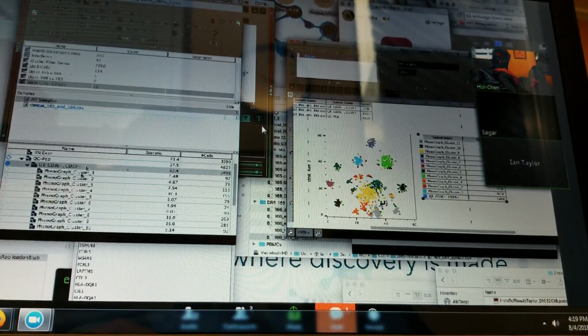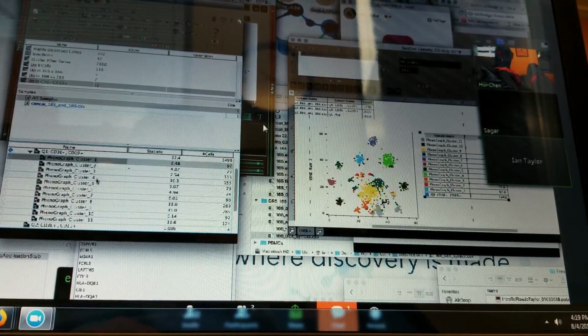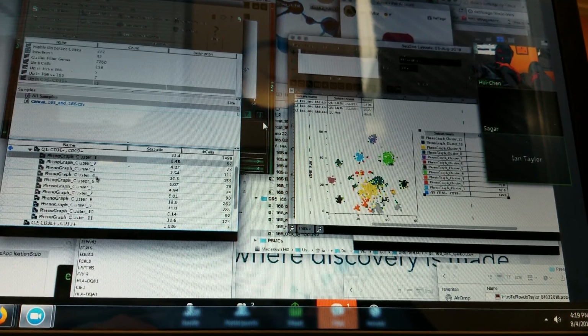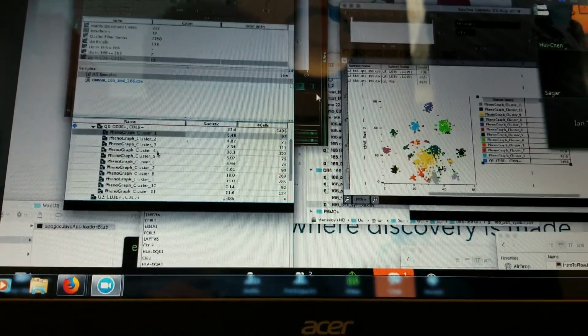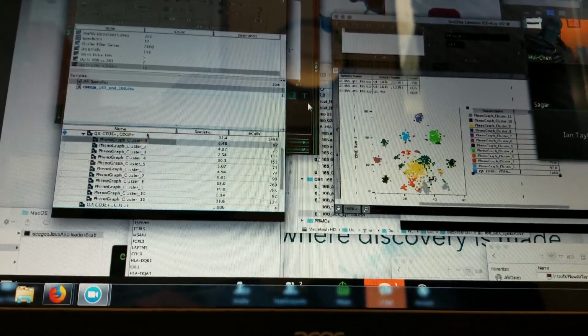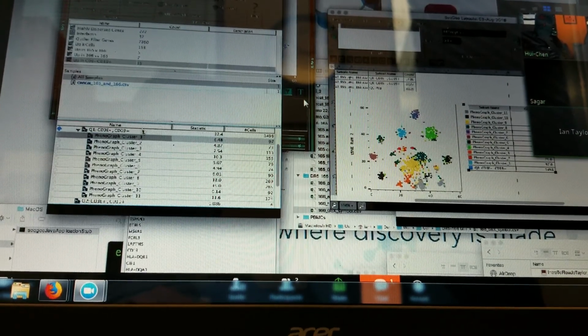Yeah, so each cluster is defined here. I named them phenograph clusters 1 through 11, so there's 11 different clusters there. And there's a lot of different things we can do with them. The next thing I was hoping to do was identify the different clonotypes that exist within some of those clusters. So that gets us into VDJ. Is that what you mean? Yes, that'd be wonderful.